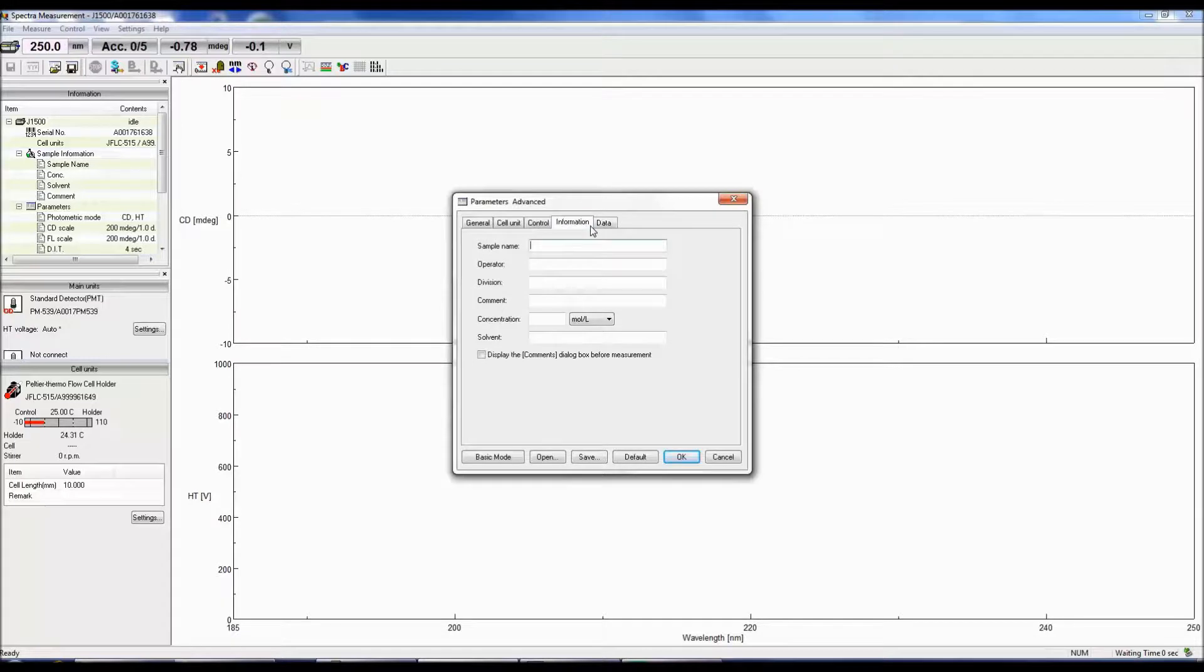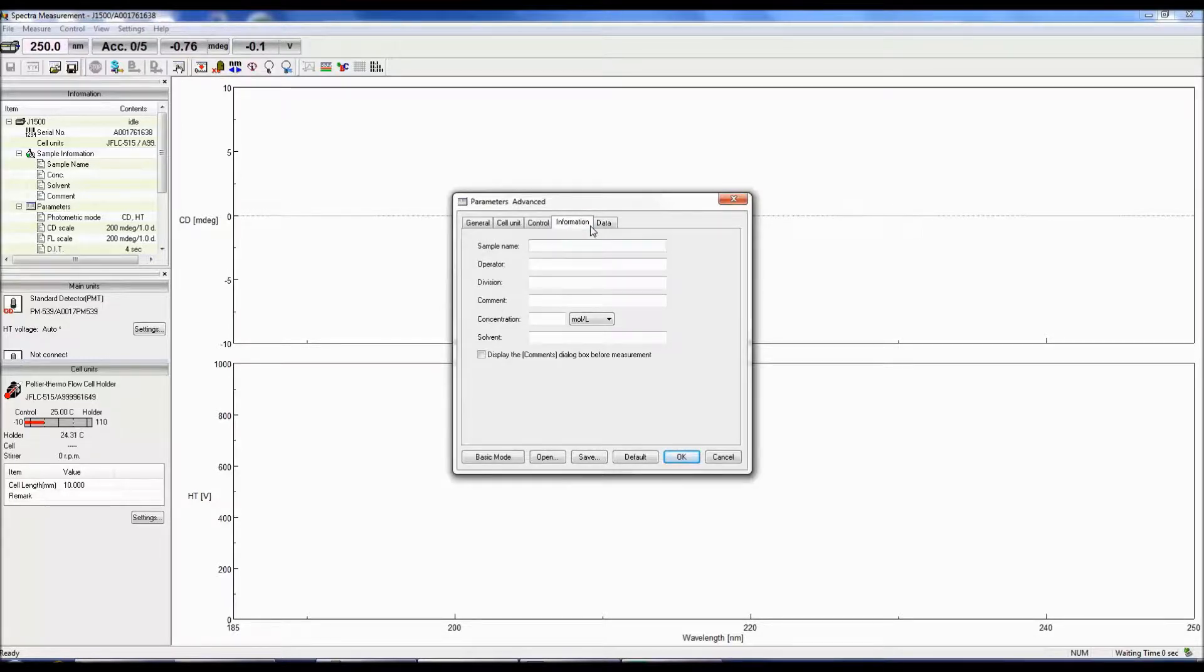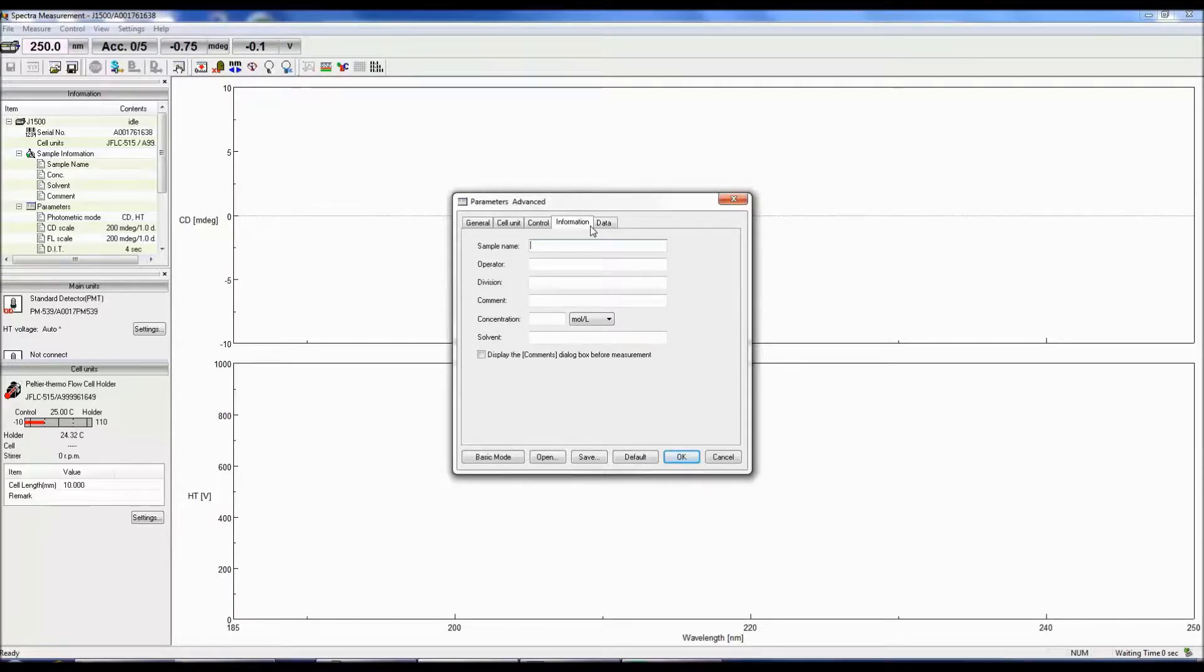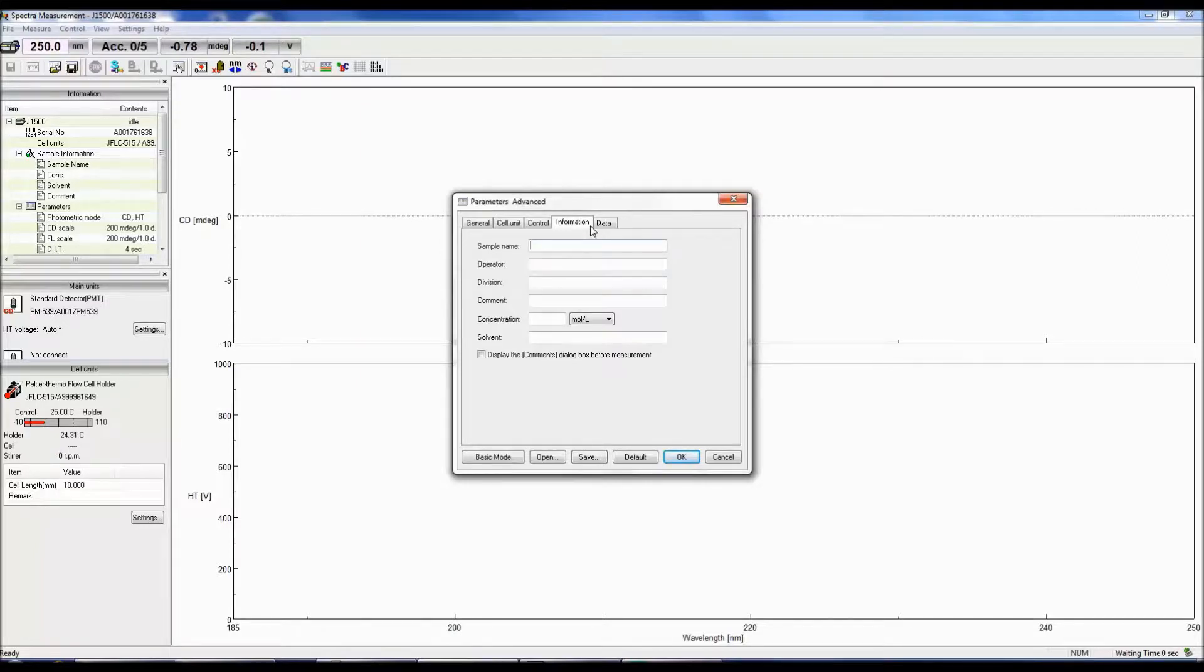The information tab allows you to populate the desired fields such as sample name, concentration, and solvent. These comments can also be displayed in the comments dialog box before the sample measurement. All information provided here can be later viewed in the information tab and spectra analysis for each spectrum.